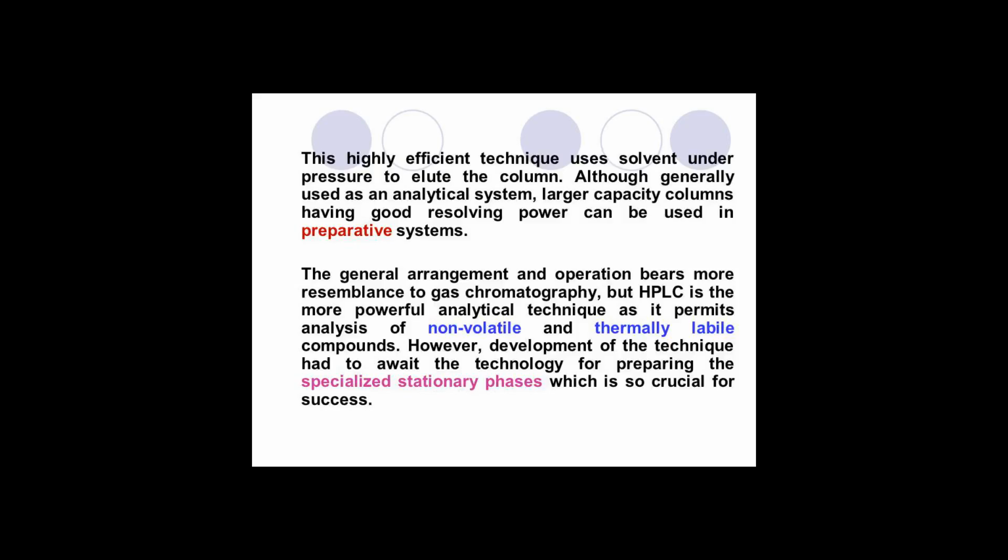This technique is used for mild separation and recovery of proteins and protection of their biological activity in protein analysis, hydrophobic interaction chromatography (HIC). Another important factor is the mobile phase pH, since it can change the hydrophobic character of the analyte.